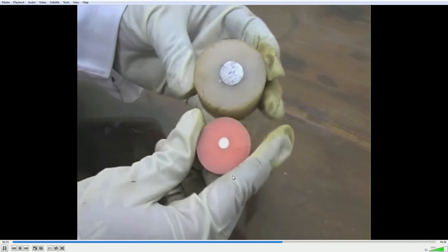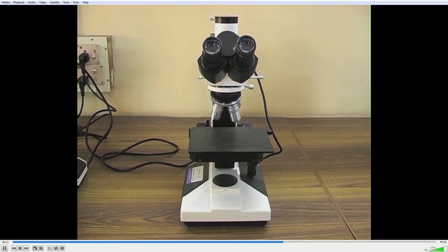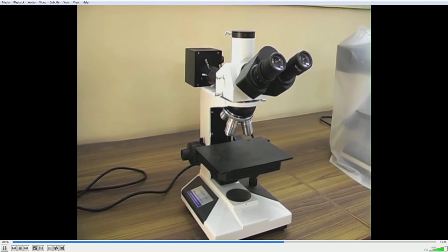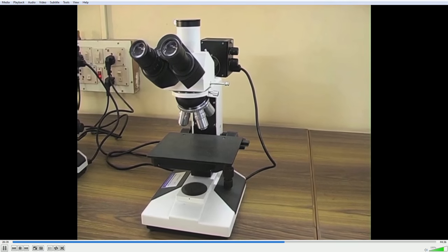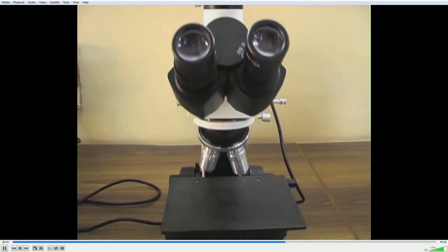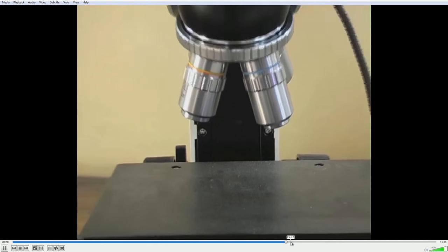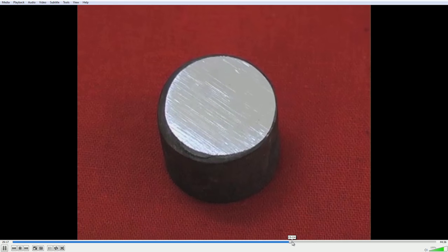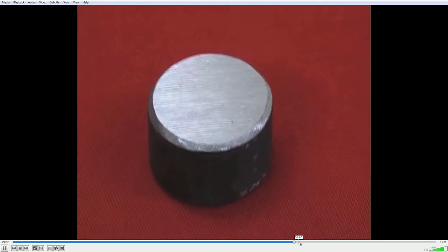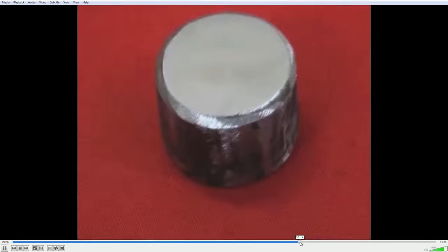The specimen can be taken to the metallurgical microscope. I will now show typically how the scratches from the various grinding papers look like under the microscope.